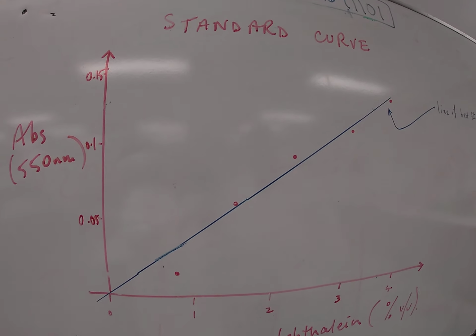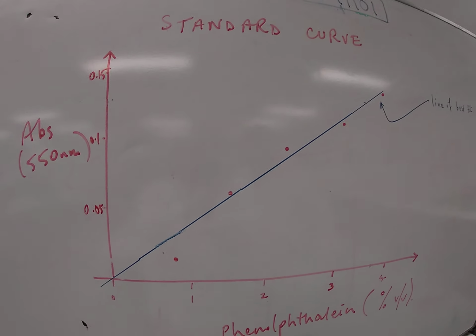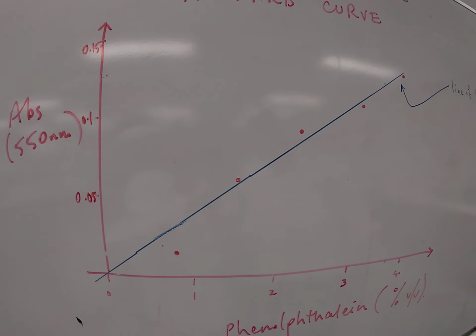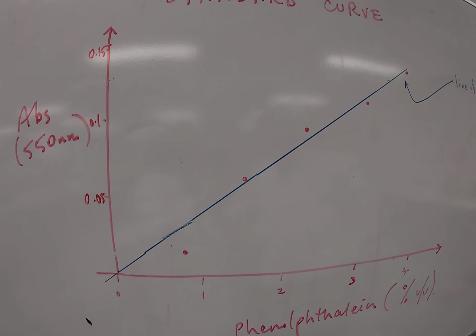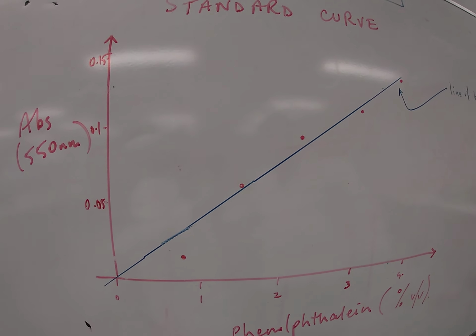That's great, Bob. And so this is just a rough example of a standard curve. How could students actually do this in a more accurate way? They could graph this manually by drawing on a bit of graph paper, or use an Excel spreadsheet.